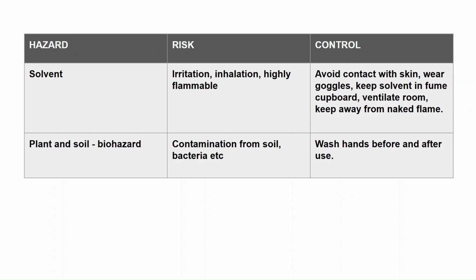Another thing as well is obviously there's a biohazard, because you're using a plant, and also the soil that the plant's coming from, because things like that can have harmful bacteria in them. And also, there's a possibility that you can be allergic to the plant or the soil, that can cause skin irritation, things like that. So obviously the main precaution to take there is to wash your hands before and after doing the experiment.